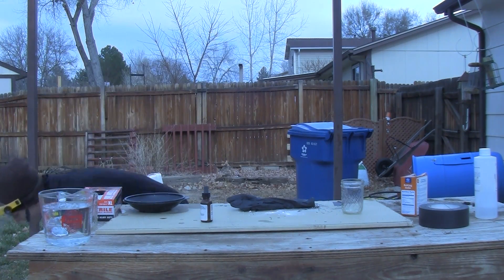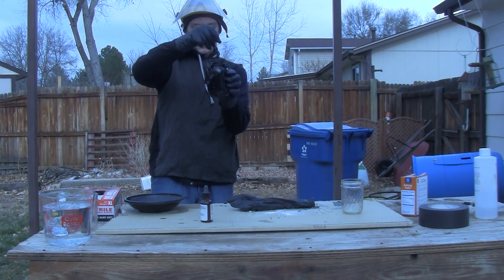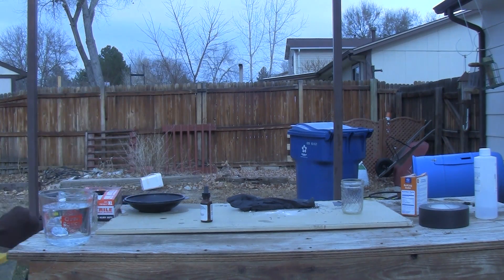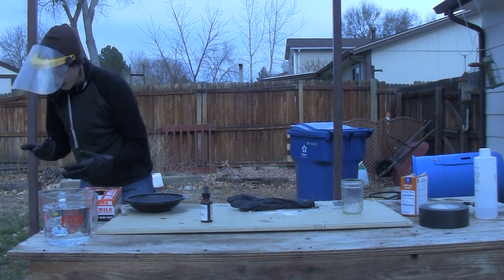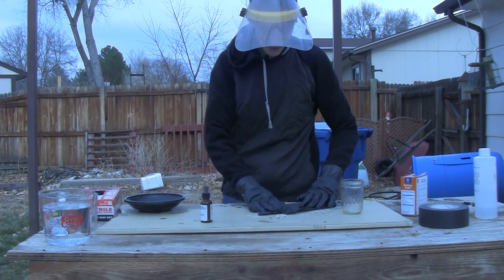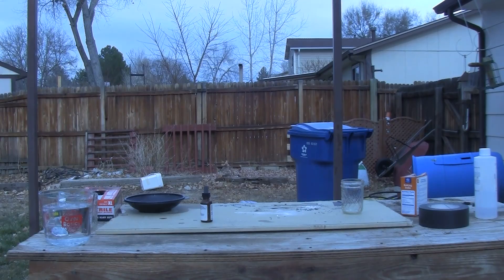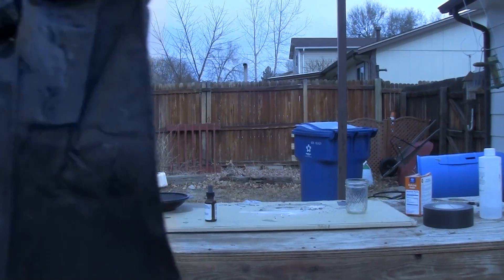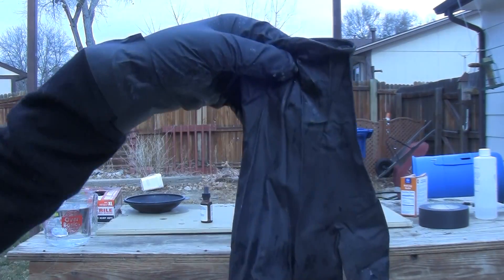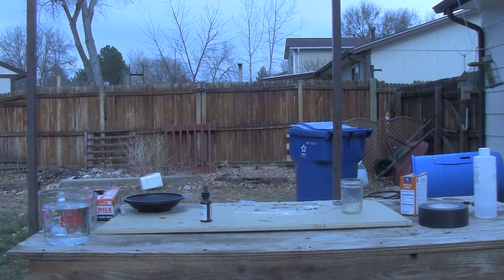Hello everybody, this is Scott. I've just finished up with my first video in my sulfuric acid series — the sugar charring demonstration. Today I'm going to be putting sulfuric acid on what I am currently wearing, which is a nitrile glove. It's just a spare one that I have.